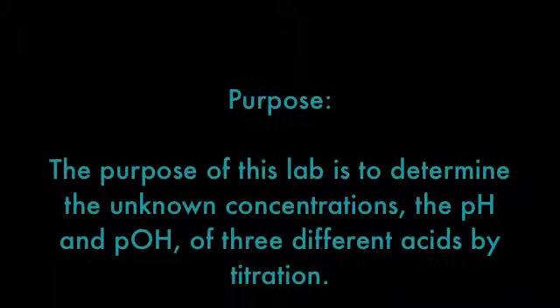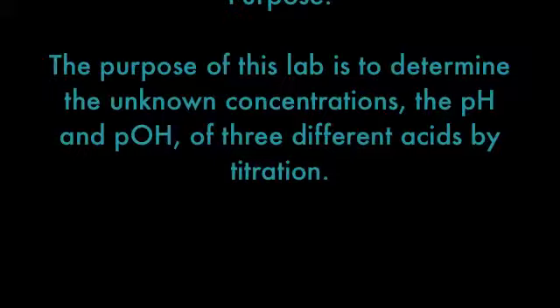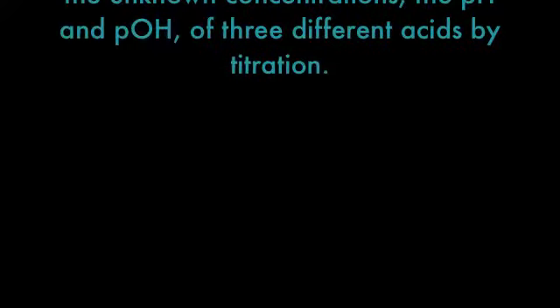Purpose. The purpose of this lab is to determine the unknown concentrations, the pH and pOH, of 3 different acids by titration.